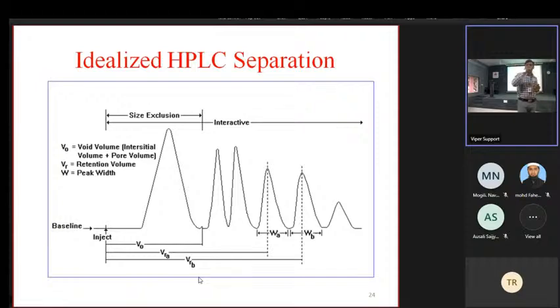So for retention time, we also have to fix the lambda max of the UV detector. For example, you are evaluating caffeine. Caffeine lambda max is 272. The entire experiment we do at that wavelength, and we get the peak for caffeine at the lambda max of caffeine.